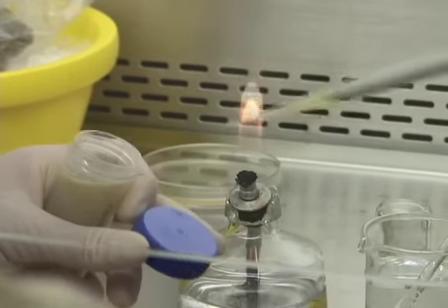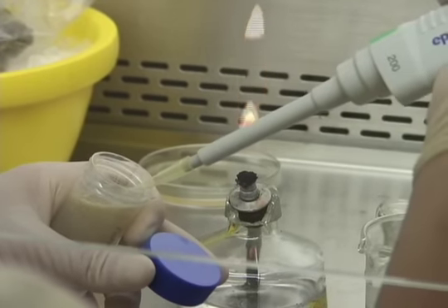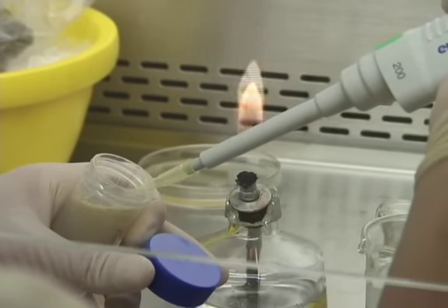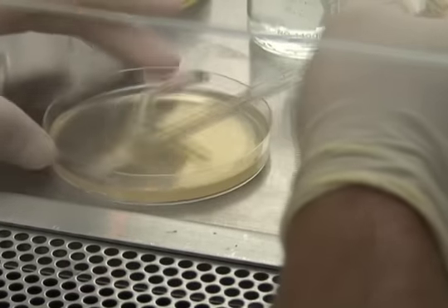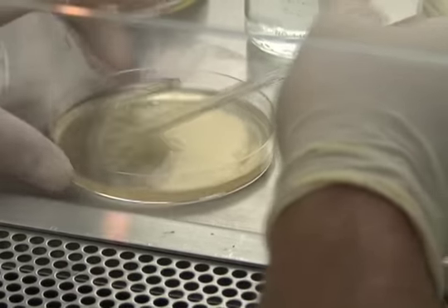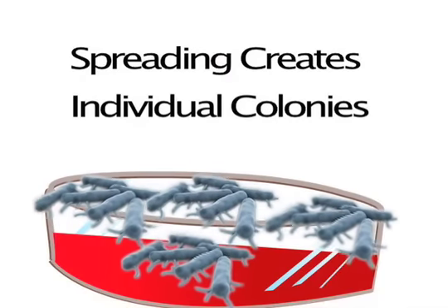We just want to get 50 microliters. Once we've got the bacteria on the plate, we want to spread them around. Spread them out in slow circles. That way instead of one big bunch, we've got a bunch of nice individual colonies we can pick out later.